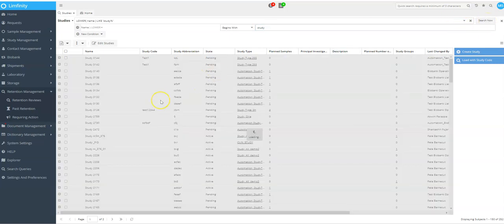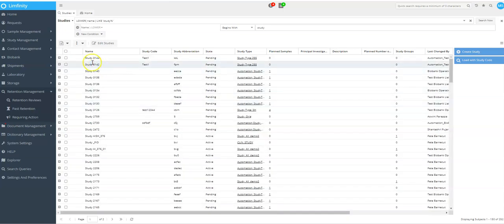So now if I hit search now, it should return the same results because all of these have the same letters regardless of their capitalization. If I were to include a capital letter, it will return 0 results because it's only looking for lowercase in this search bar.